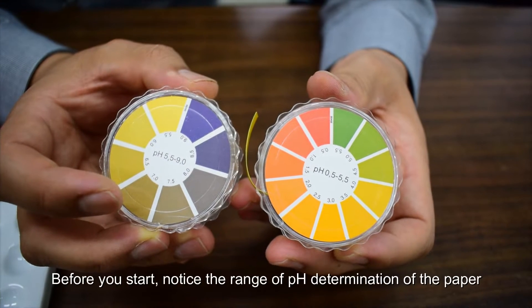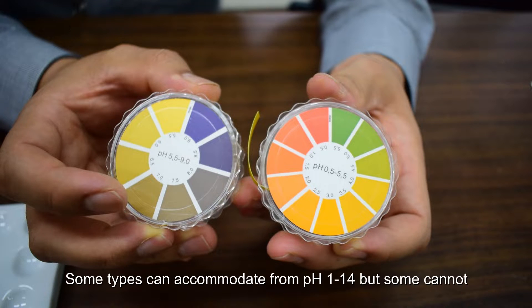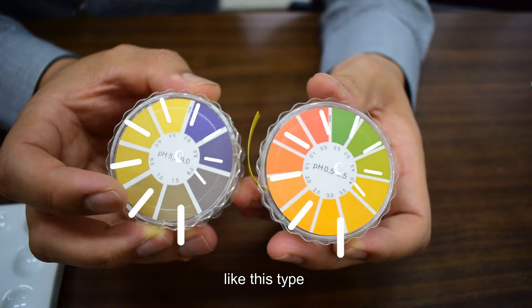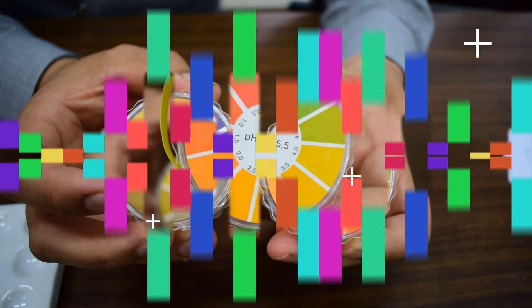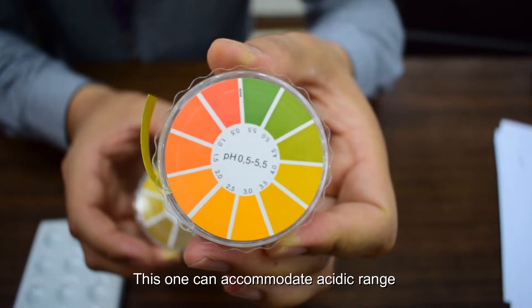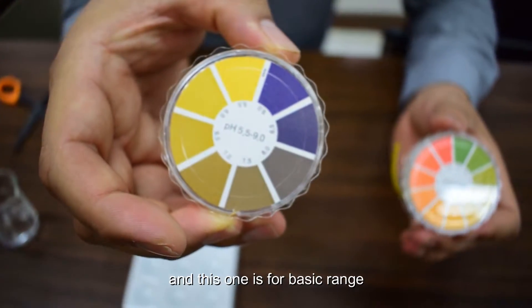pH Determination. Before you start, notice the range of pH determination of the paper. Some types can accommodate from pH 1 up to 14, but some cannot, like this type that we will use in the laboratory. This one can accommodate acidic range and this one is for basic range.